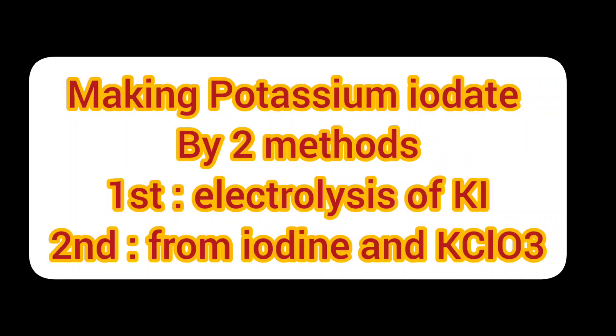In this video, I will be making potassium iodate by two methods: first by the electrolysis of potassium iodide and second from iodine and potassium chlorate.